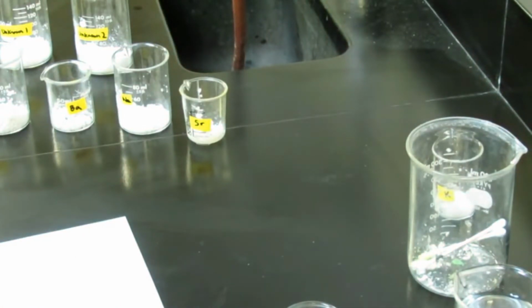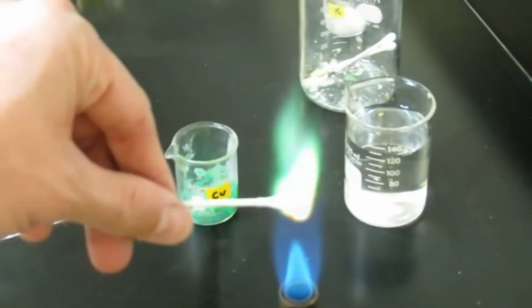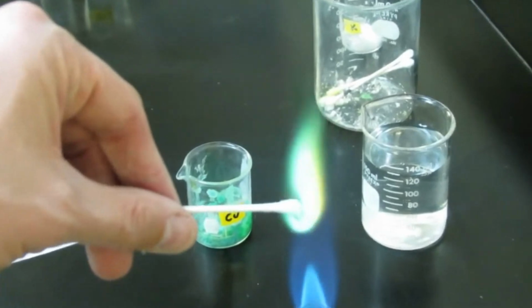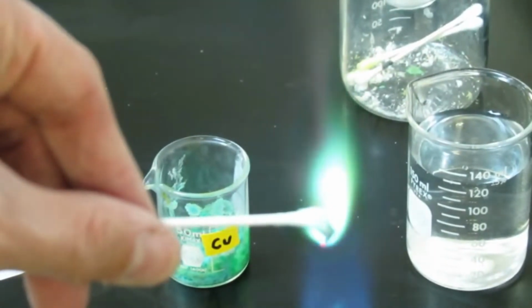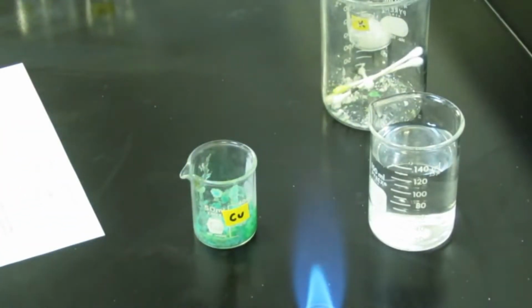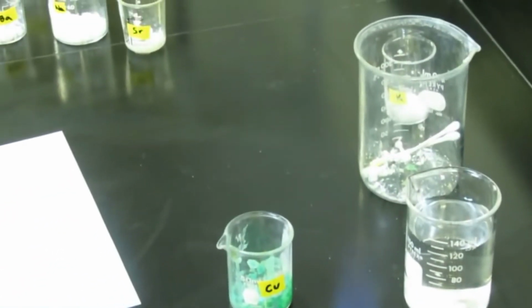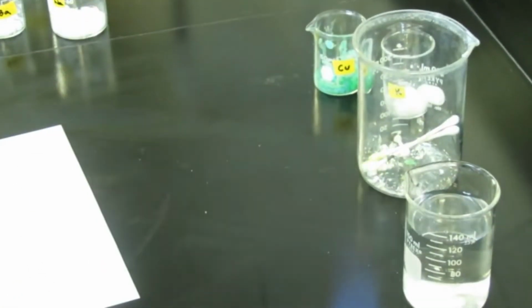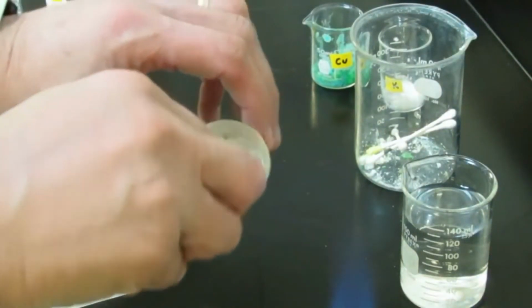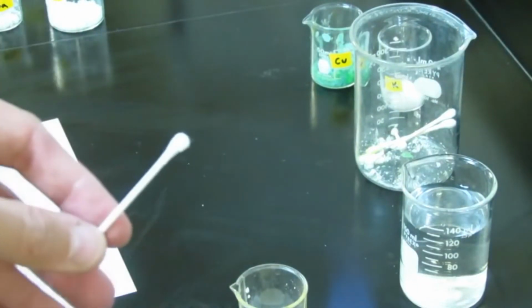And once again, let's get that in focus here for us. Put that in the burner flame, and you folks will decide upon the color of that flame. Alright. Got that for copper, folks? We're done. Put that into our waste container, and we'll repeat the process for our next salt, which is going to be strontium this time. Okay, so we'll get a clean cotton swab, dip it in distilled water, and we'll touch it to the surface of our strontium salt, and then we'll put that in our flame.